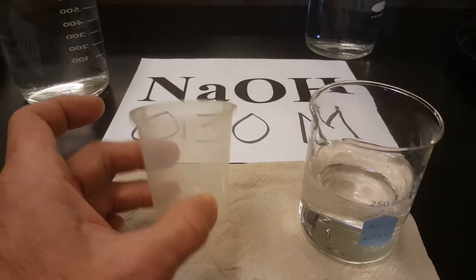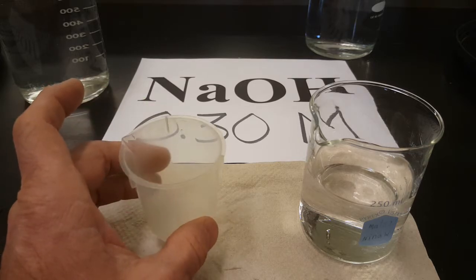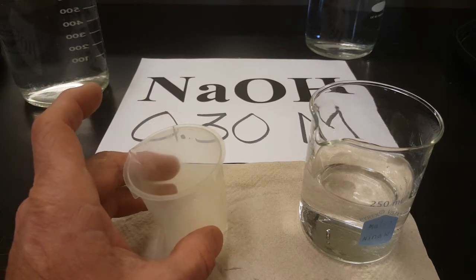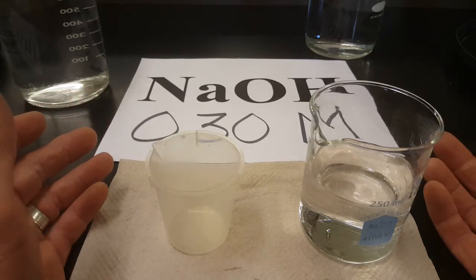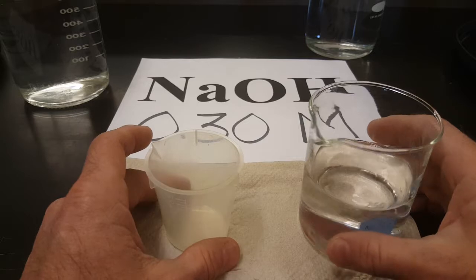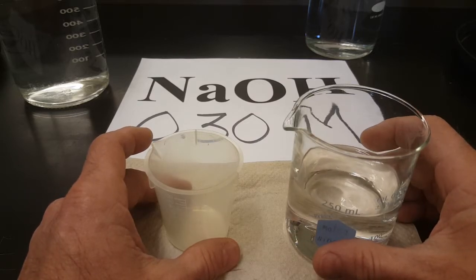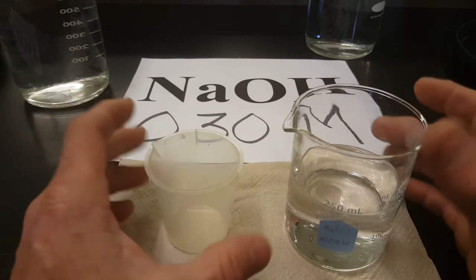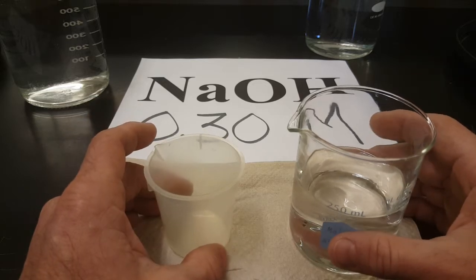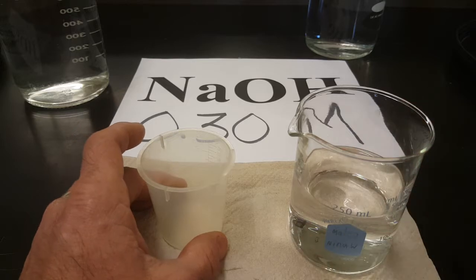Now you've got your urinalysis cup. The lab instructs you to get 50 milliliters of this and return to your table. At this point, make sure your hair is back, your goggles are on, and if you spill any of the base or get any on your hands, I have spray bottles of vinegar out, and you can spray your hands with vinegar and then go to the sink and wash the base off. It's pretty diluted, but if it's left on your hands for a really long time, it could cause a burn.